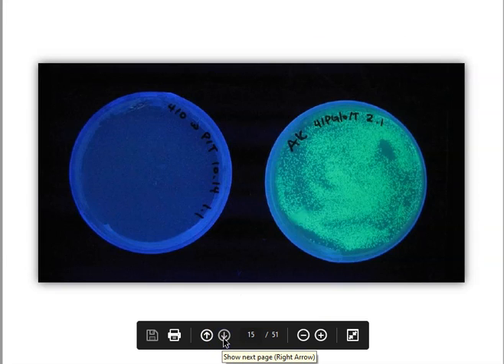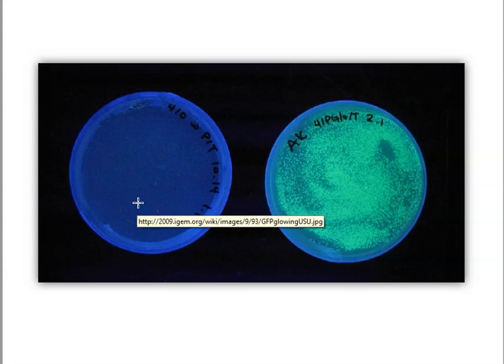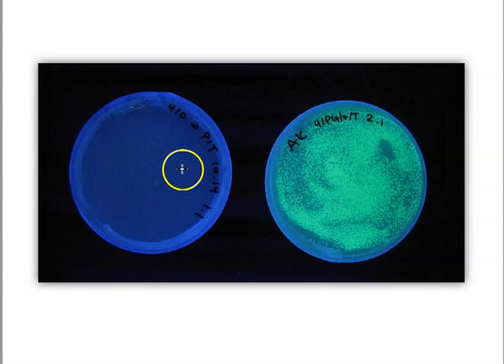So this is an example of a promoter sequence. In this state, the bacteria E. coli carrying the promoter do not express the gene. However, after induction with IPTG, you have an induction of the gene. Now you will note that on this plate you will see a few dots of color. This is indicating expression, and this may be a leaky promoter, which means that the promoter is not very tightly regulated, and in some cases it has expressed the green fluorescent protein.